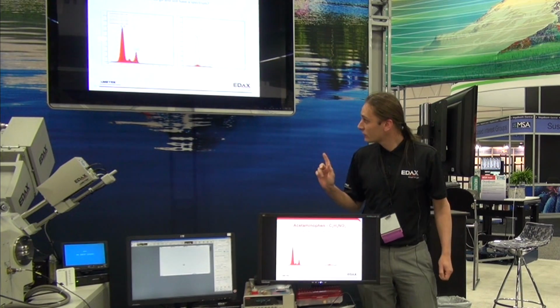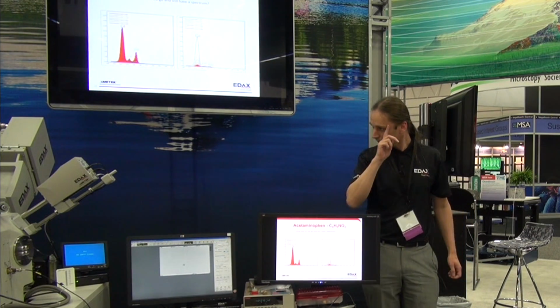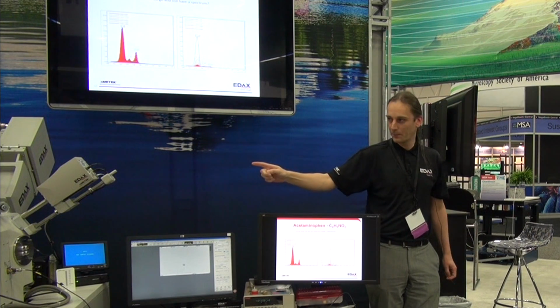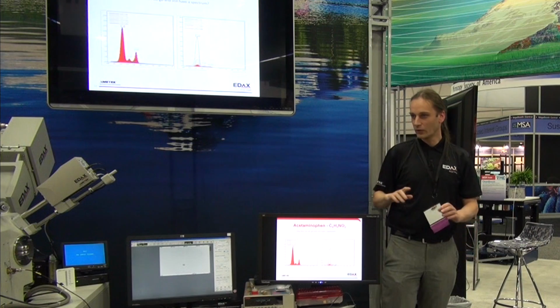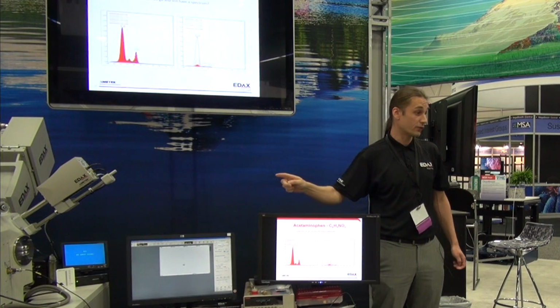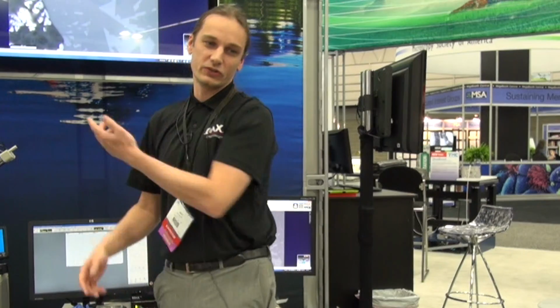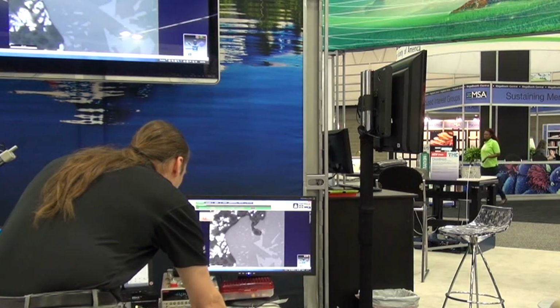And for this, I would like to show a couple of spectra from this system. On here we have two different detectors. One on this side is our regular detector with a polymer window, and on the right-hand side, the black one, that's with a silicon nitride window. So there's a difference in the window technology here. I used our team software for all data collection and most of the data analysis as well.